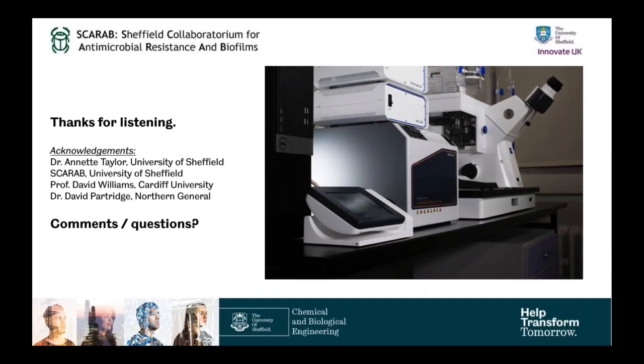And I believe we have an answer from Andrew Ridley, from LabTech, regarding the height of the channel. The channel height in the custom BioFlux plates is 75 micrometers high. I think I'm right in saying that if you have your custom surfaces, it will be about 200 micrometers high.